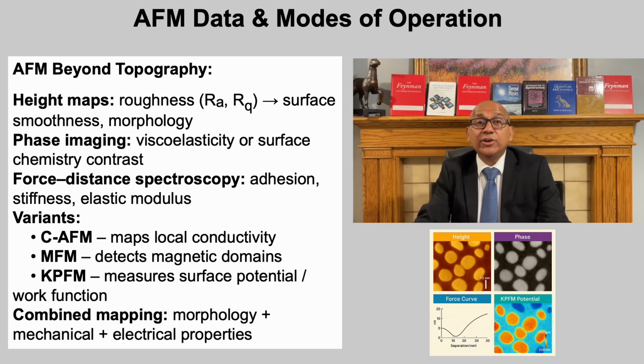Phase imaging records the phase lag between the cantilever's drive and response in tapping mode. This phase lag reveals variations in viscoelasticity, adhesion, or surface chemistry, allowing different materials in a composite to be distinguished without labeling.